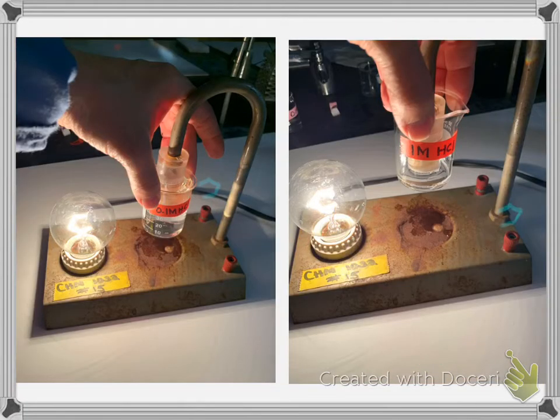Now in this example, I have HCl. This is 0.1 molar HCl, and this is 1 molar, the more concentrated one. I will tell you it does have ions, and how do I know? Because the light is very bright, so it would be a strong electrolyte. You choose the numbers. You've got to write the numbers between 0 and 5.